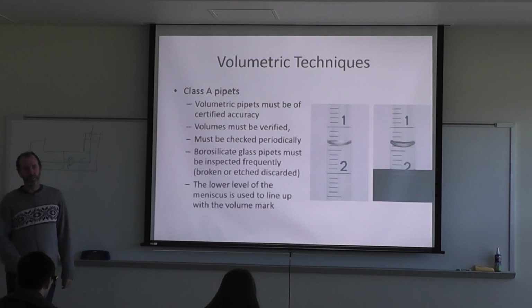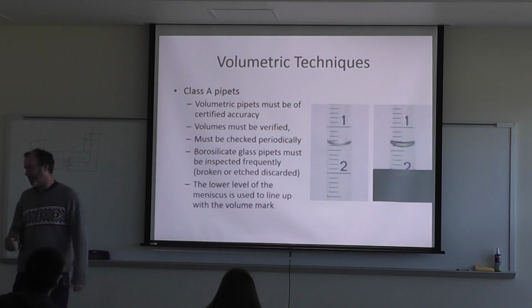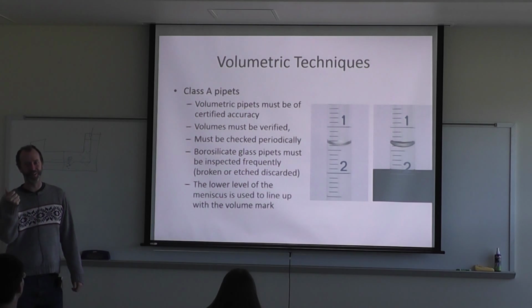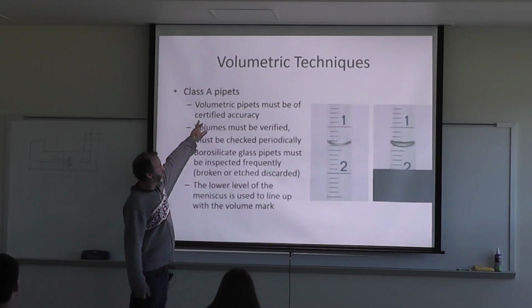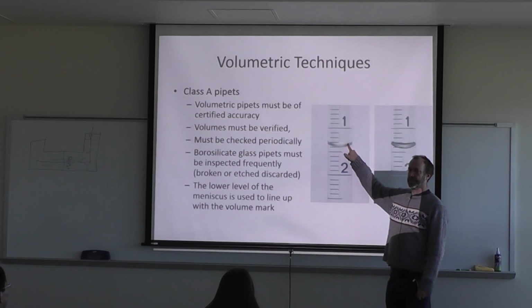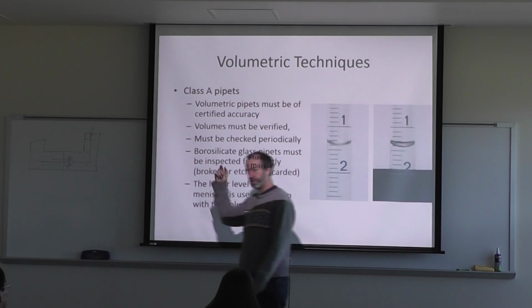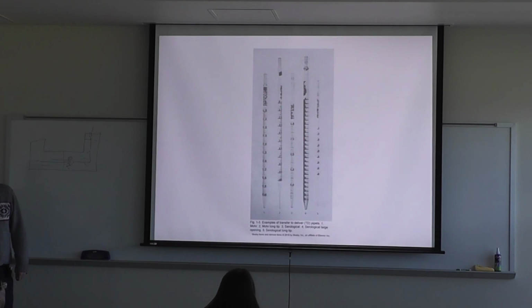So, who's used one of these pipettes before? So not everybody. Basically, they're real easy. At least you can use them with those bulbs, which is kind of a pain, but we have the electric ones, which are a lot easier. They're certified to a particular accuracy, and you read the volume at the bottom of the meniscus, right? You suck it up how much you want, and you can spit out the exact quantities too. It's not super accurate, but it can be.